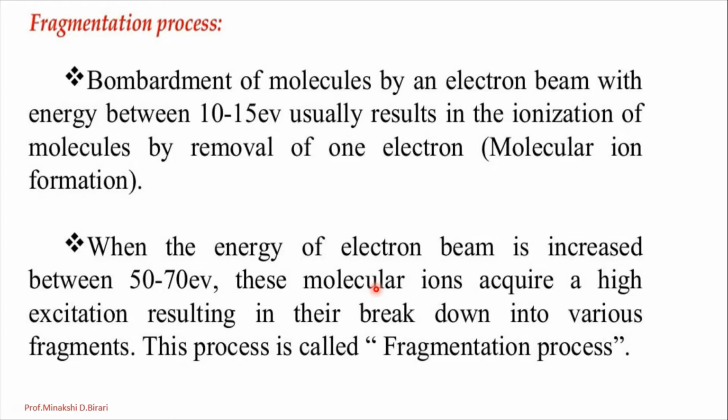As we have discussed, the molecular ion is unstable, and due to this instability it will be further fragmented into daughter ions or fragment ions. This process, the cleavage into a number of fragments, is called the fragmentation process.